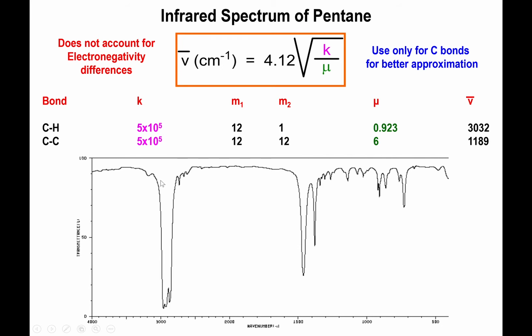Now, what we're really seeing here is not the absorption spectrum, but rather the transmittance spectrum, which means that we're looking at how much light has passed through the actual cuvette that holds the sample. And notice that here the values go from 0 to 100, right? So if your sample has absorbed a lot of the light, the amount of it being transmitted is going to go down. So whenever you see these things reaching almost the x-axis, what that's telling you is that you're absorbing a lot of light strongly.